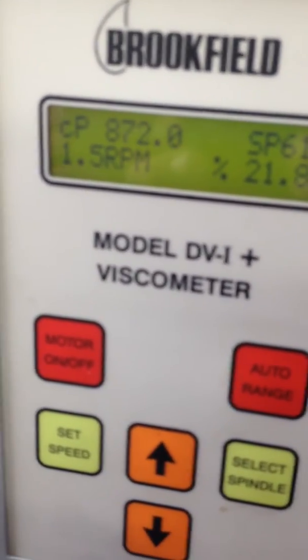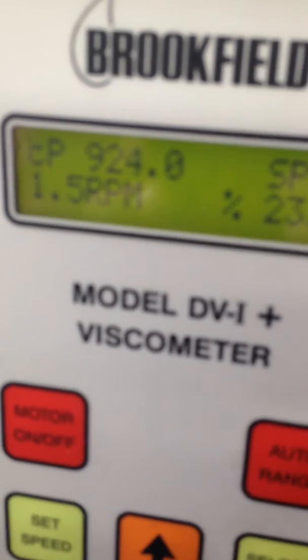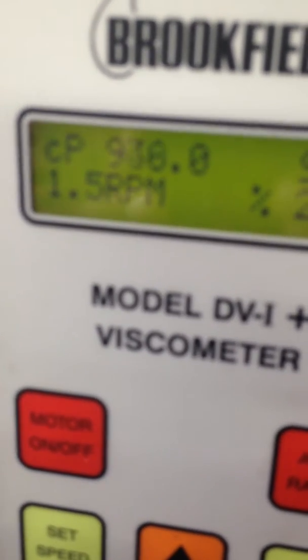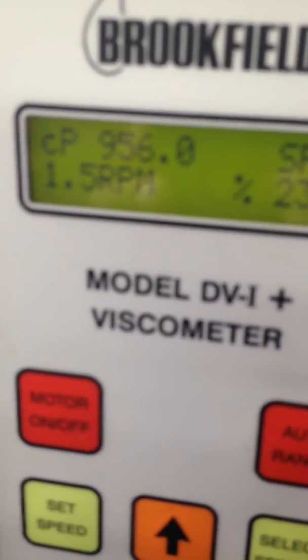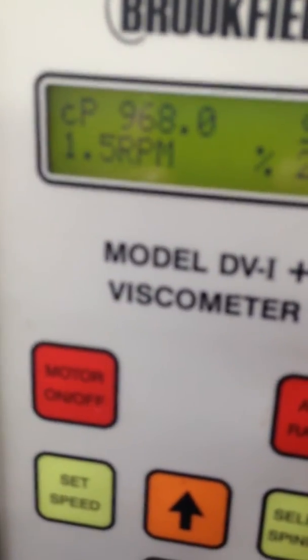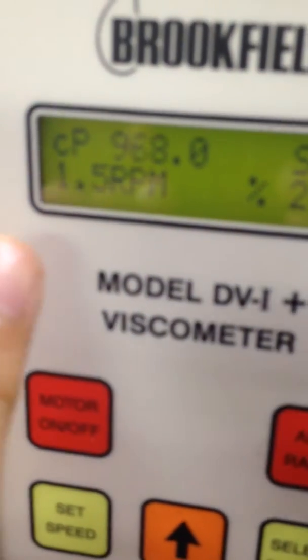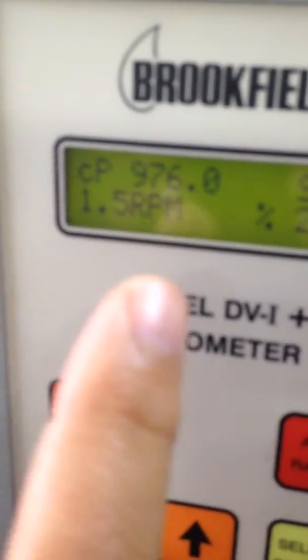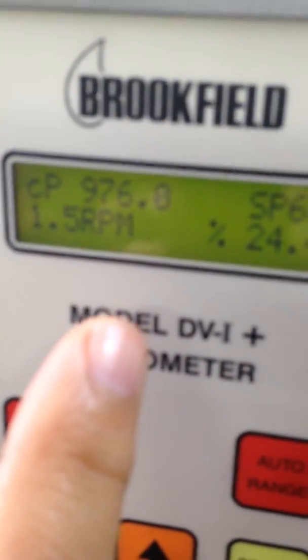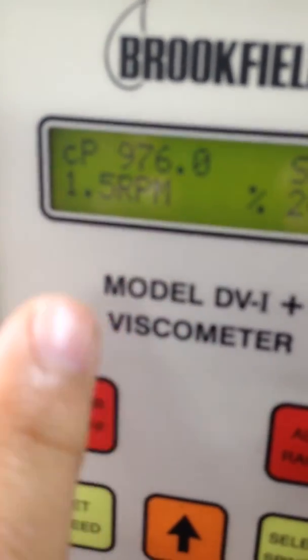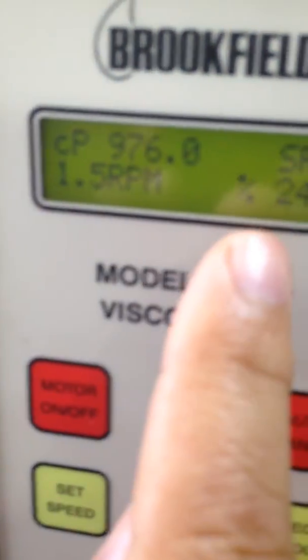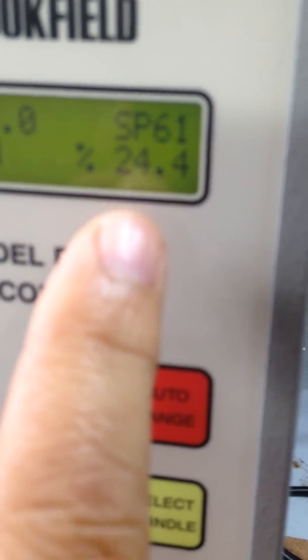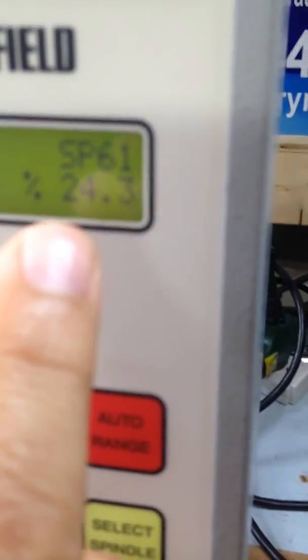The viscosity now, you get at least let the spindle turn five times. It's 1.5 revolution per minute so it's about five minutes. You gotta let it run for five minutes so that it gives you the viscosity. This is the range, it shows you the range.